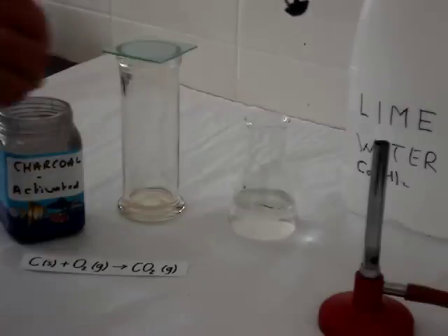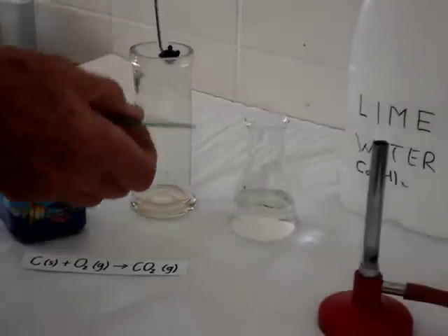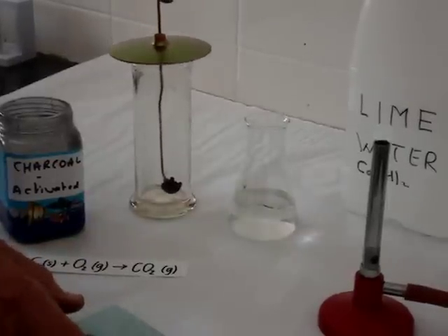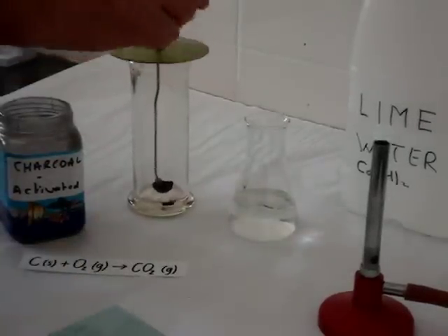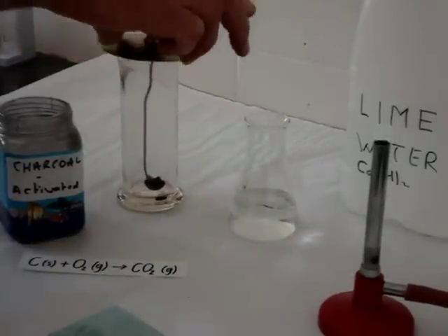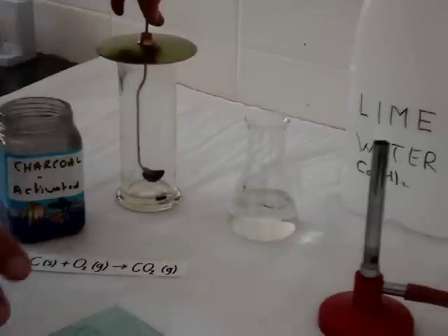You can see we have to wait quite a while, and even then we don't really see very much happening because carbon is really not very reactive.